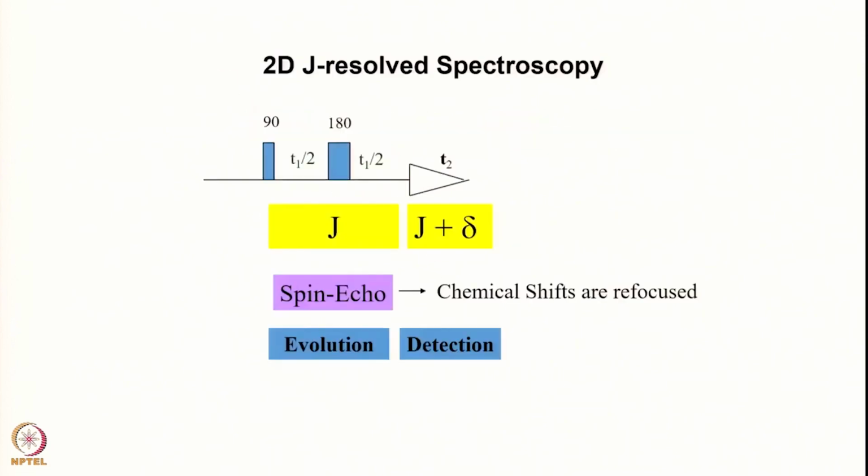Alright. So, that was the principle of 2-dimensional NMR. I give certain examples here of various kinds of 2D experiments. We will not go into the theory of these calculations, we are going to use these ideas and describe some experiments, what the pulse sequences are and what information comes from these experiments.